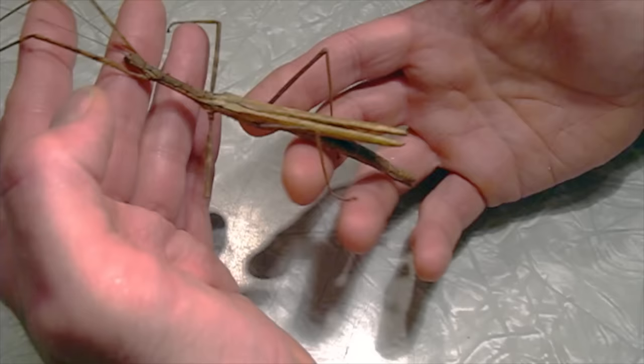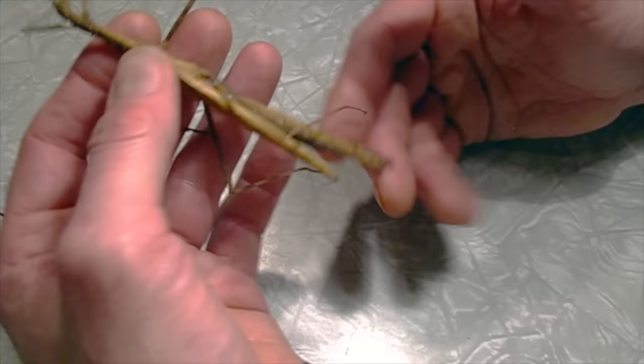Today we're going to prepare a stick insect. This is Diasbachia tamiris, an Asian stick insect. This is a captive-raised one that just died of old age. And it's got lovely wings — you can see it has nice wings.